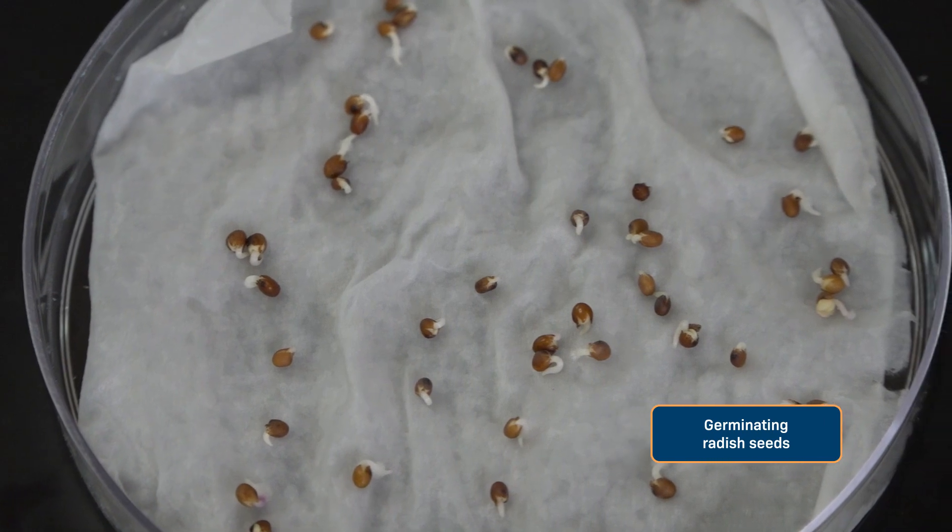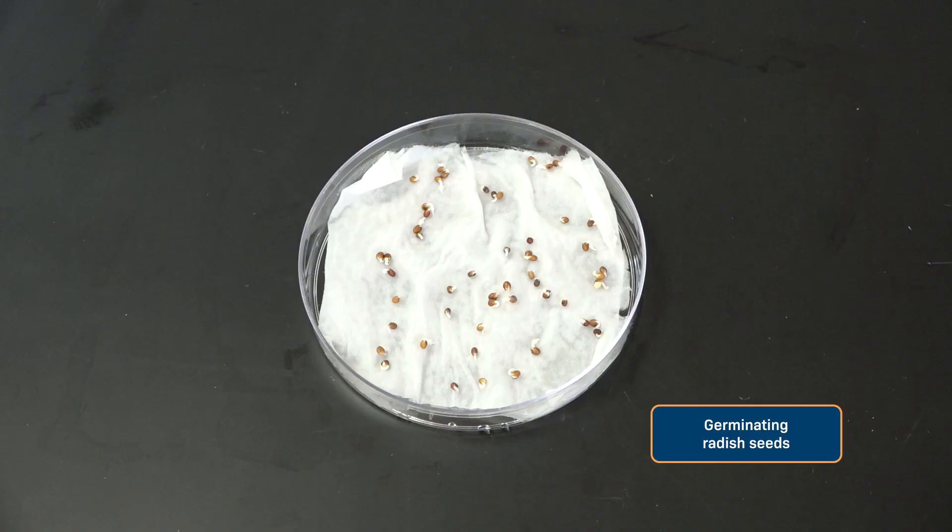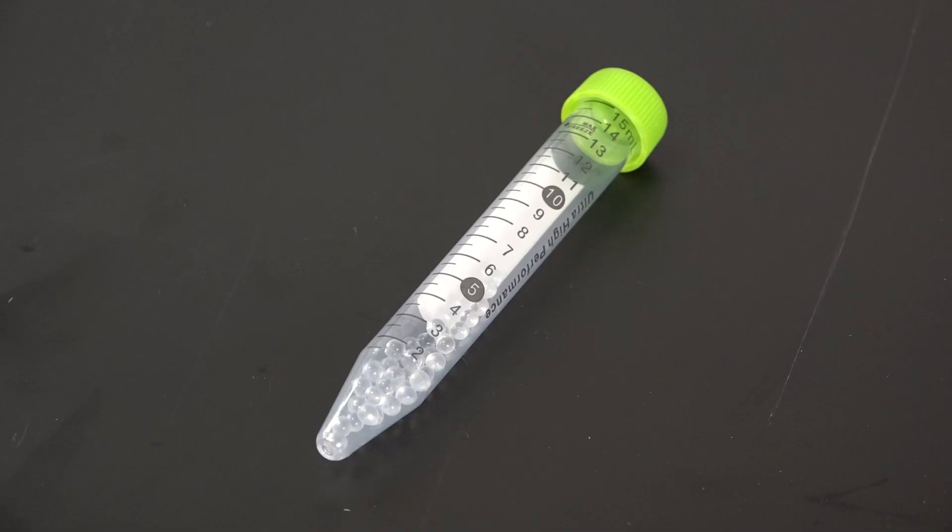In this case, germinating radish seeds. Germinating means I've soaked them in water for about 24 hours, so they're just starting to sprout. You could also use little critters like worms, ants, or flies, or play around with different types of seeds and plants. Finally, you'll need glass beads for the control respirometer.